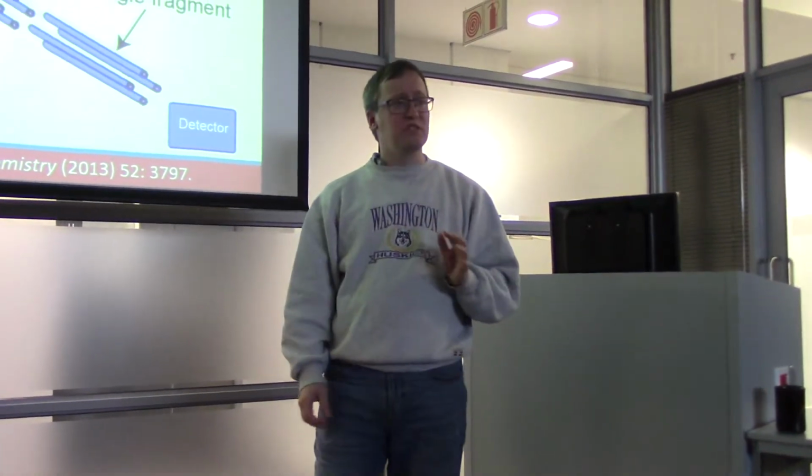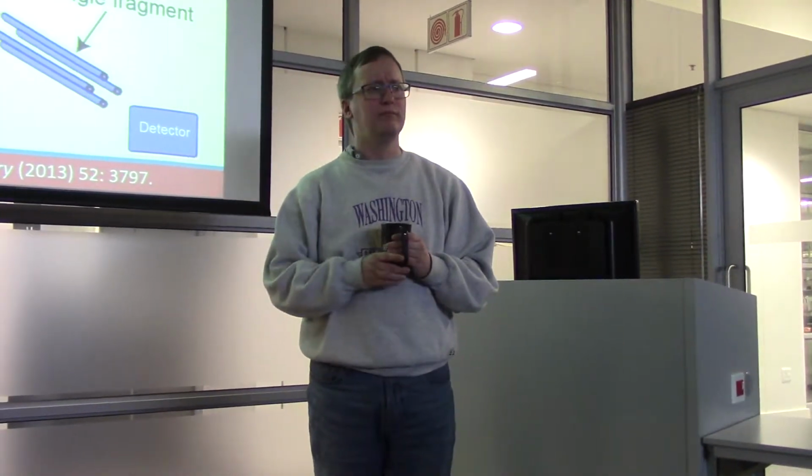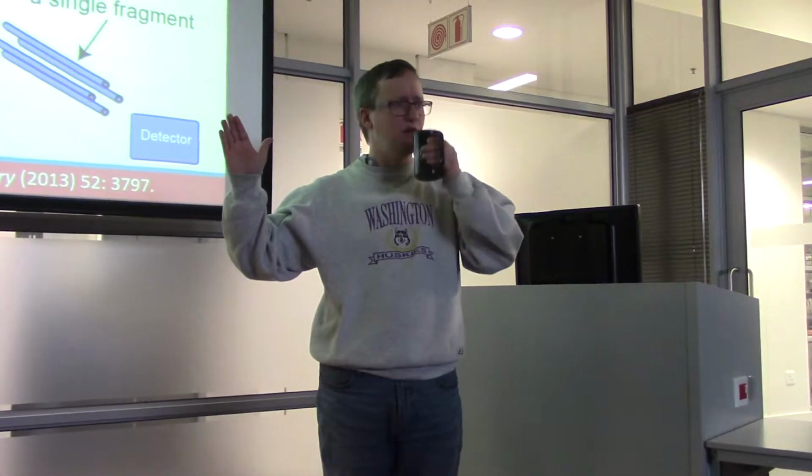So for this, we most typically use a rather different kind of instrument. Have people heard of a triple quad? Triple quad? Any mention whatsoever?